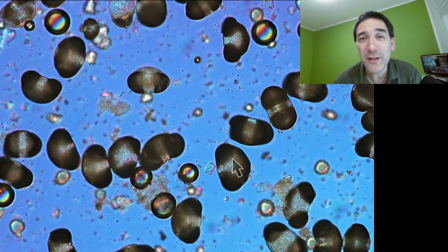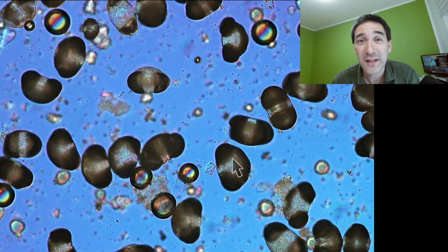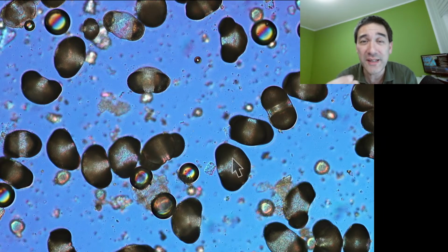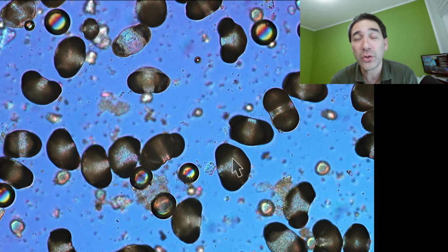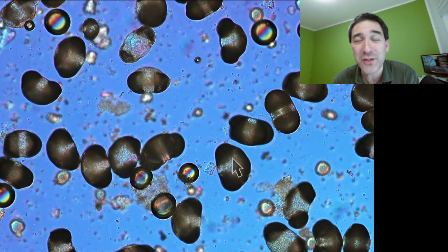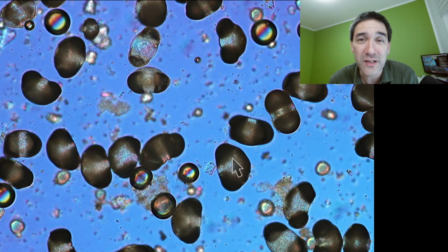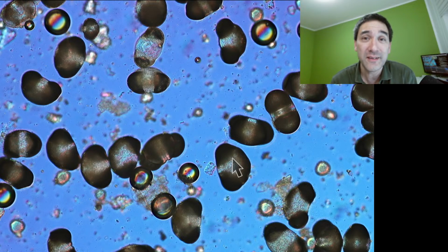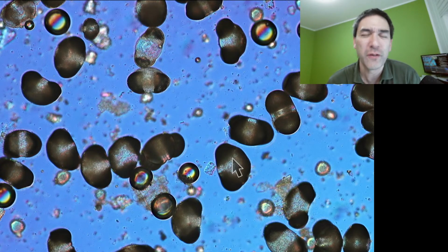However, many of those can also be of origin from the Earth. For example, if there's a company somewhere welding something, those things can appear similar. So in order to really determine whether these are micrometeorites, you have to do additional testing. Maybe you have to analyze the crystal structure or the isotopes. But independent of whether it's from Earth or indeed from space, they're kind of fun to observe.